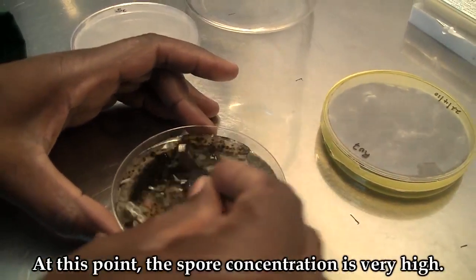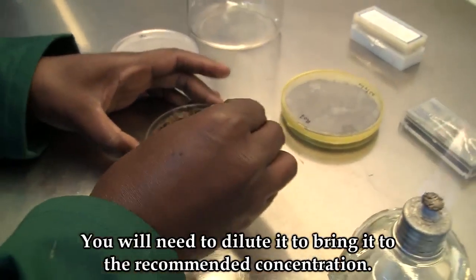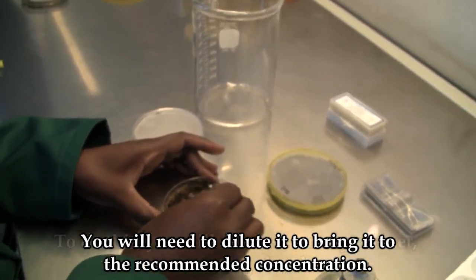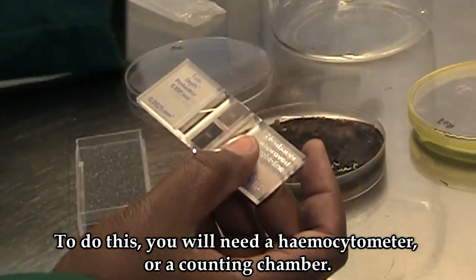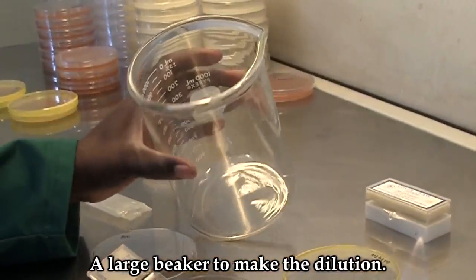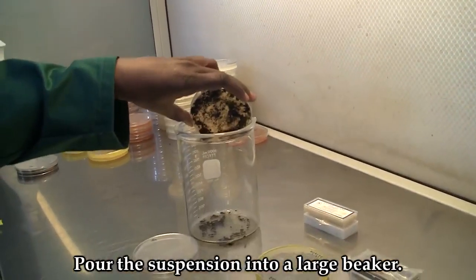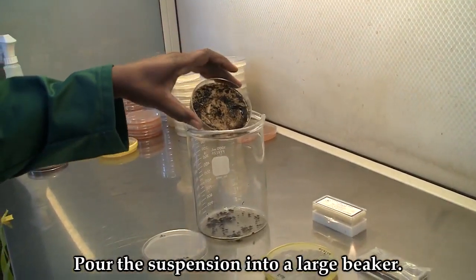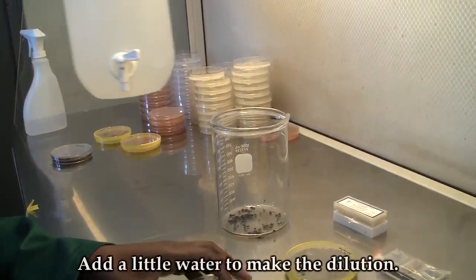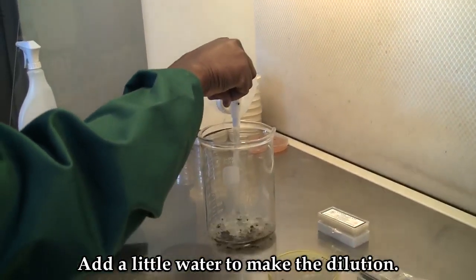At this point, the spore concentration is very high, so you will need to dilute it to reach the recommended concentration. To do this, you will need a hemocytometer or counting chamber and a large beaker to make the dilution. Pour the suspension into the large beaker and add a little water to dilute it.